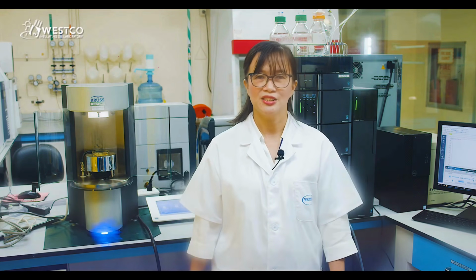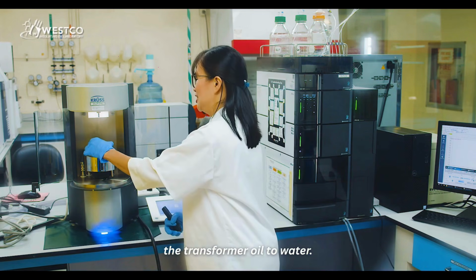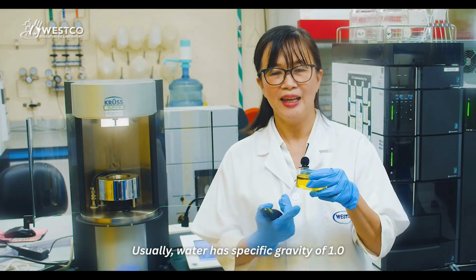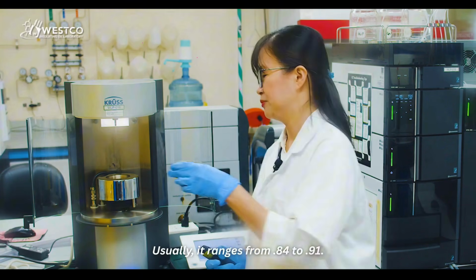First is the specific gravity. What is specific gravity? It just compares the density of the transformer oil to water. Usually water has a specific gravity of 1.0, and of course transformer oil is lighter. Usually it ranges from 0.84 to 0.91.